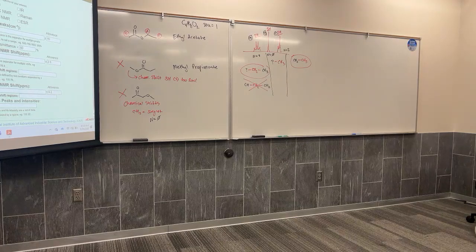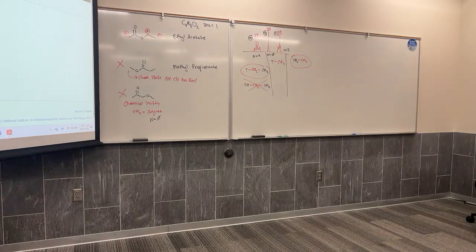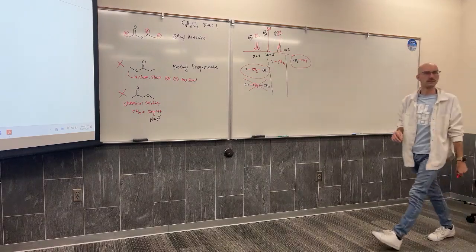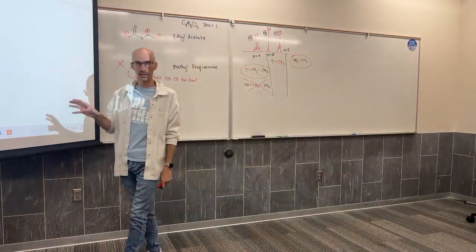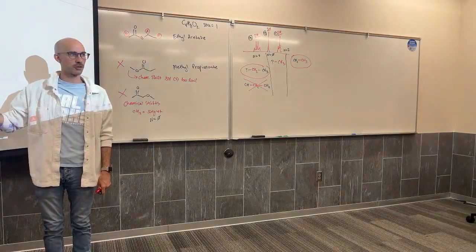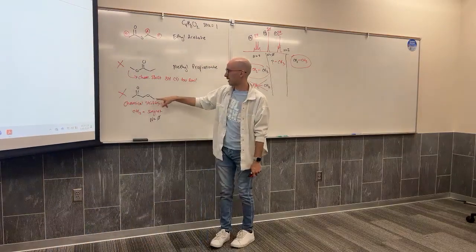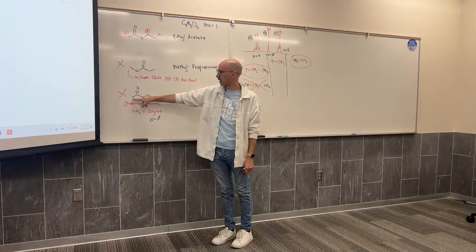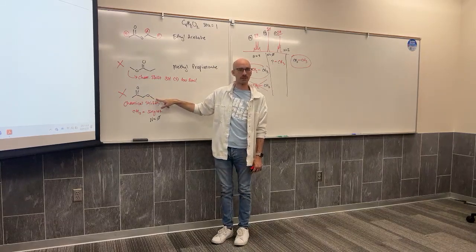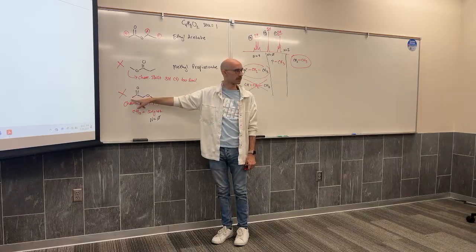The other structural isomer that we were looking at, methoxyacetone. What do you notice here? The signals look a lot different from the last two NMR spectra. There are no doublets, triplets, or quartets. They're all singlets. And that's because in methoxyacetone, the CH3 has no neighbors. The CH2 has no neighbors. This CH3 has no neighbors.